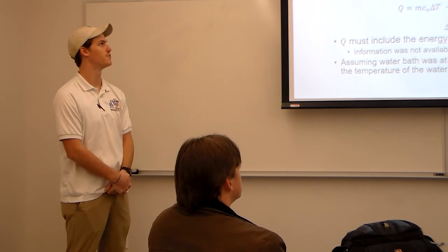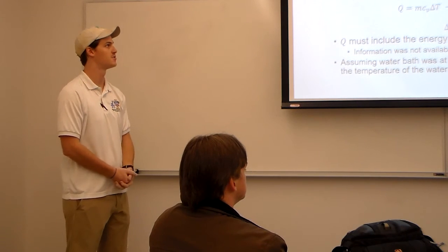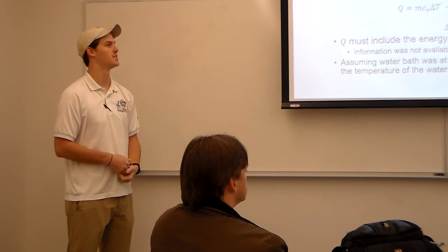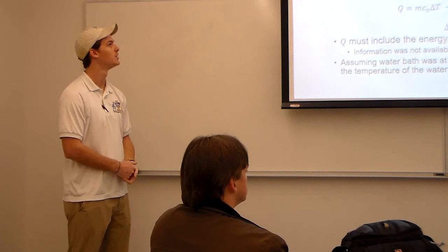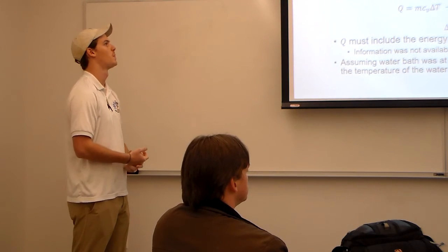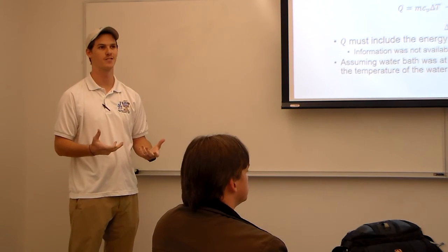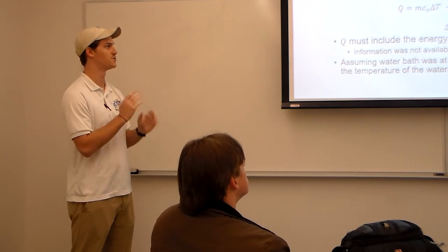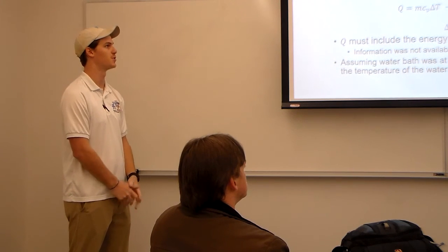And then define the Q for a known fuel. Q is equal to the delta H, where the delta H is the molar enthalpy of combustion, times the molar mass times the mass used in the application, in this case 1.1 grams, or 1 gram, excuse me. This Q that we found here does not take into account the ignition wire. I did not have the data available to me to produce the value. So this is just the Q of combustion for the benzoic acid.